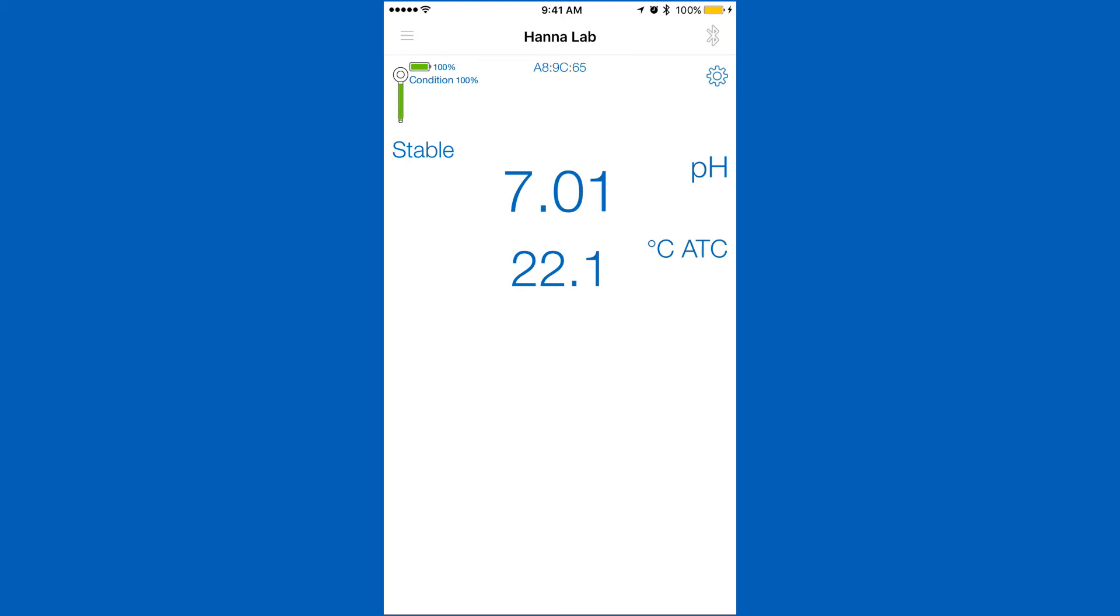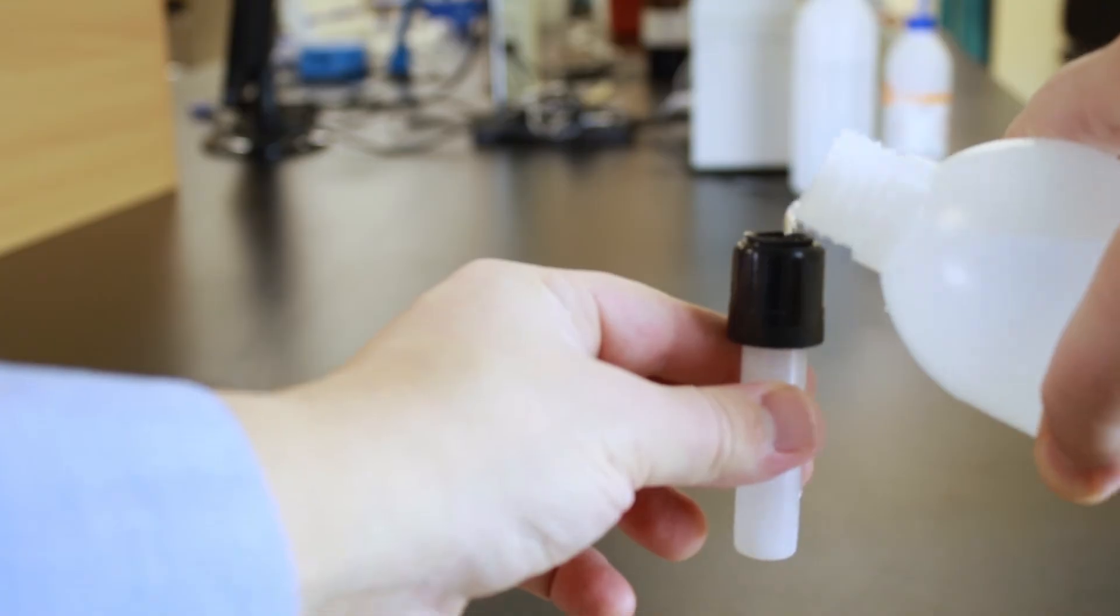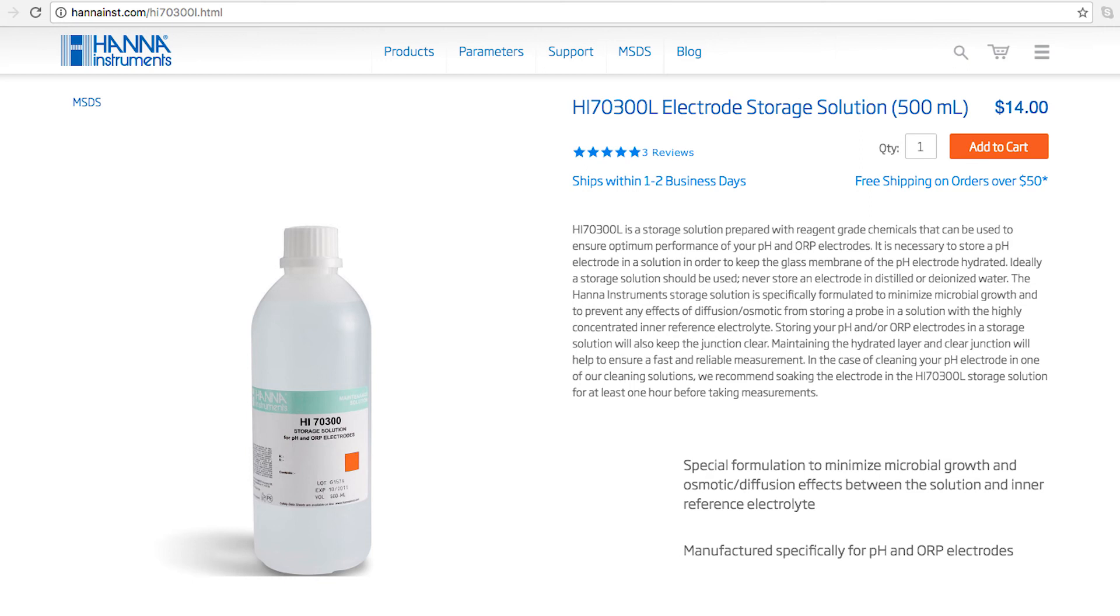When you're not using your pH probe, keep it in storage solution. Without proper storage, the electrode gets dehydrated. It's best if you rinse and store your electrode after every use. We recommend our HI70300 bottle of storage solution. If you don't have storage solution, pH 4 buffer works too.